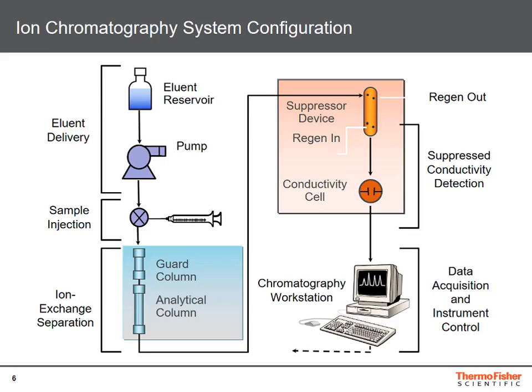However, separation and detection are fundamentally different from traditional reversed phase chromatography. We all know that ions are not really retained on a reversed phase column. That means we need an ion exchange separator column for the separation of ionic species. Also, organic solvent-water mixtures cannot be used as a mobile phase. Instead, we need an electrolyte solution.